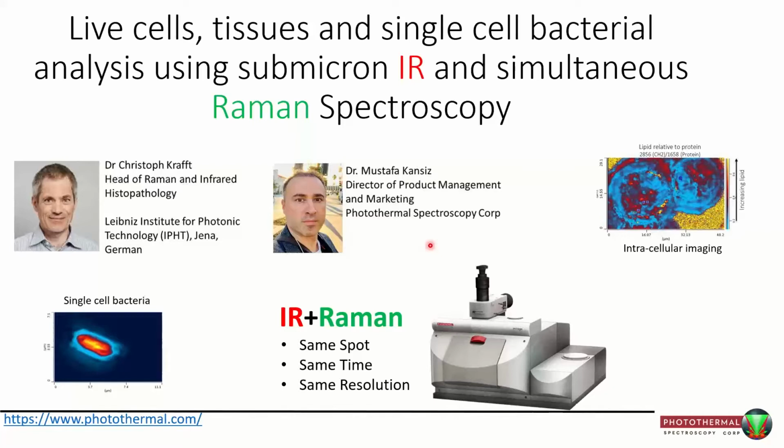So the main talk, that's Dr. Krafft's talk, will be all about live cells, tissues, and single-cell bacterial analysis with submicron IR, so that's O-PTIR, together with simultaneous Raman spectroscopy.